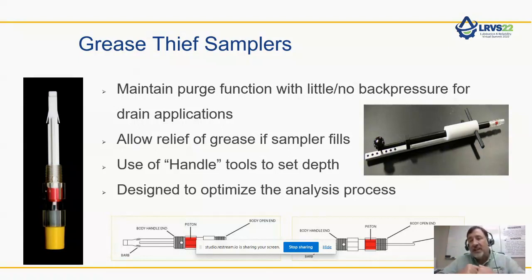Other times, we need to go in and get that grease. It's not coming out. It's in an enclosure, a housing, and you can see to the right the tool that is used. It's an adjustable tool. It holds that sampler, that thief, so that it can be inserted into the machine to a known depth. Then it can core the sample and extract it.